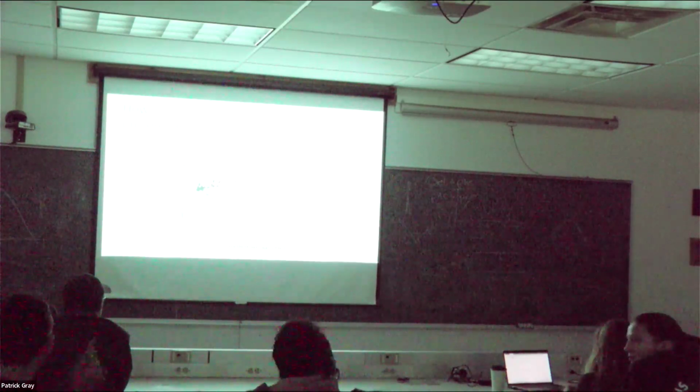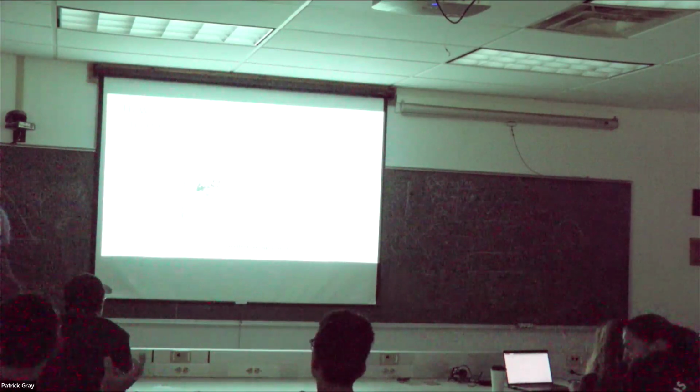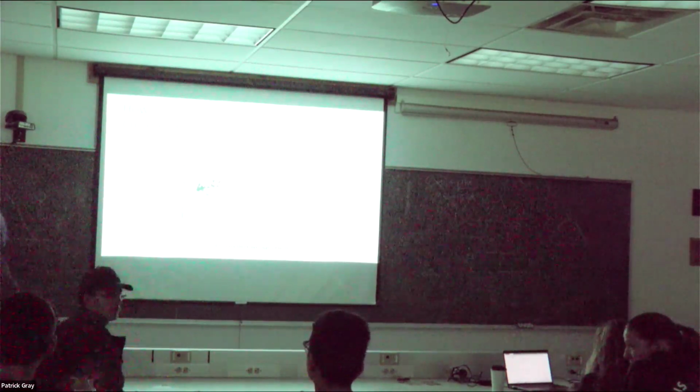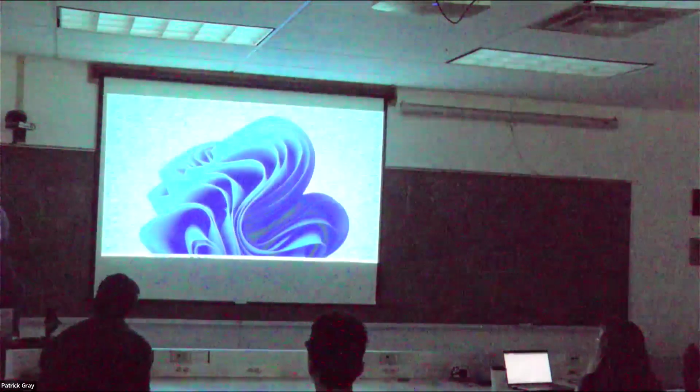Yes. I was surprised when you said HPLC and the fluorometric methods match, when I'm coming from a legal context. So that line, as we go further. Yeah, makes sense. Yeah.